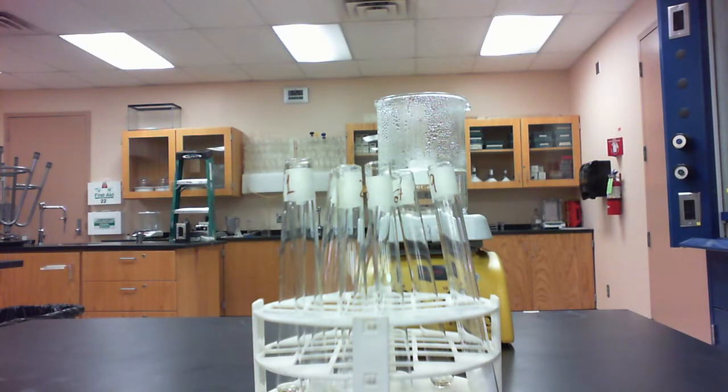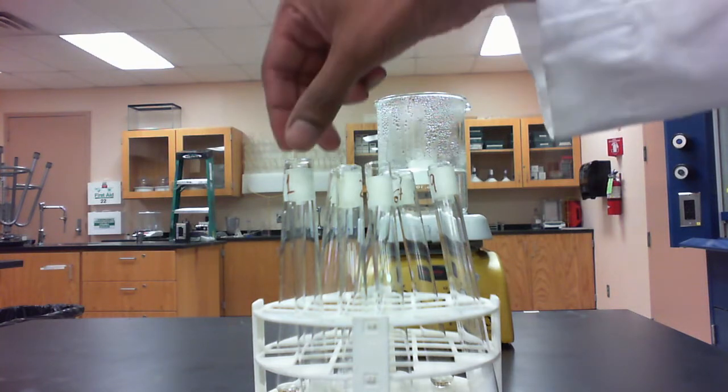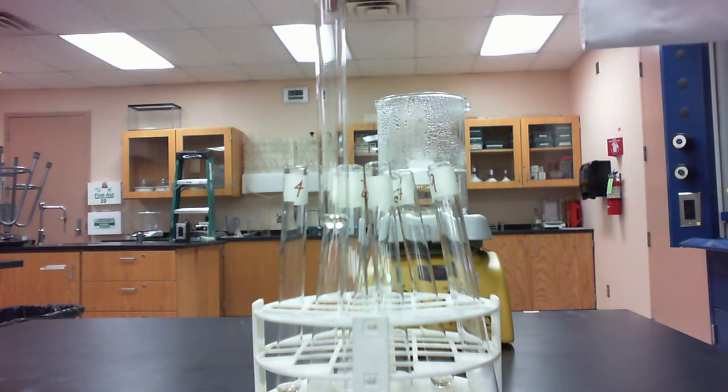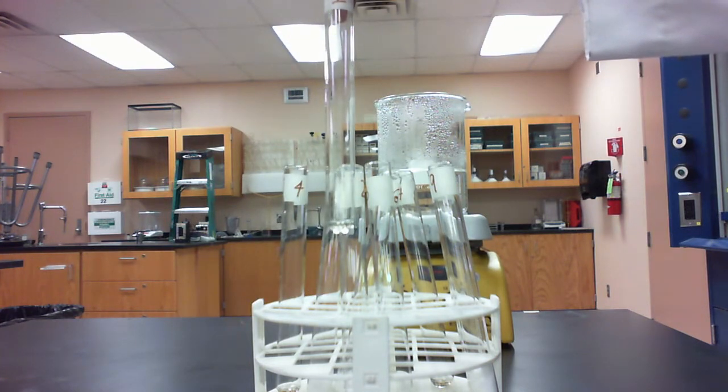Alright, so we're going to assemble the reaction, and the first thing that we did here is to measure out the carboxylic acid in each of these labeled test tubes. And I'm following the procedure that's outlined in your lab manual. So in test tube 1, I've measured out approximately 1 milliliter of glacial acetic acid.